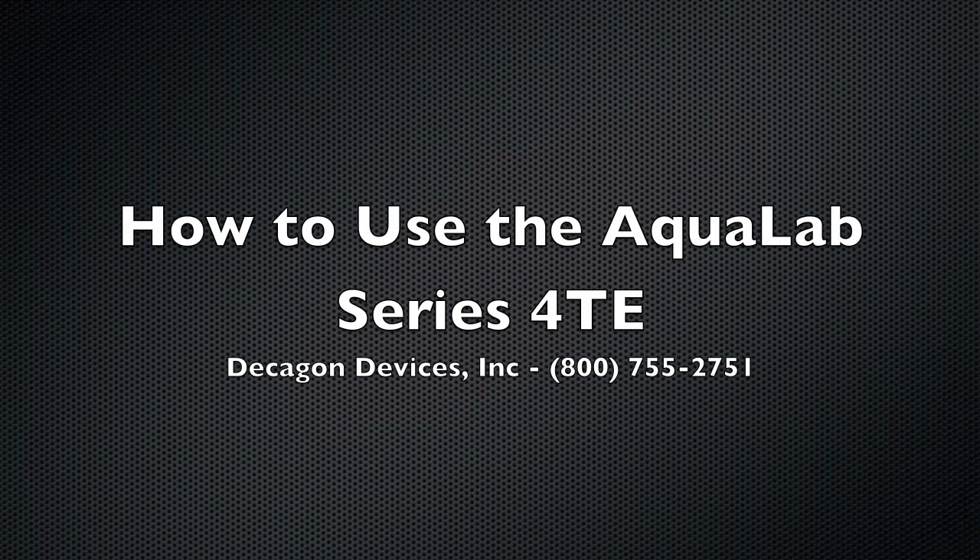The new Aqualab Series 4 TE measures water activity in 5 minutes or less, and that's about how long it'll take me to show you how to use it.